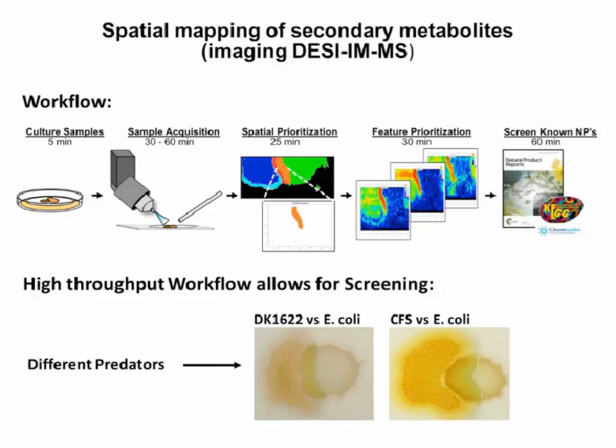We do believe there are some places for streamlining where we can get over those bottlenecks. But right now, 3 hours is much faster than how we could do our previous analyses using a static methodology. So this rapid sampling has momentous application in high throughput screening.